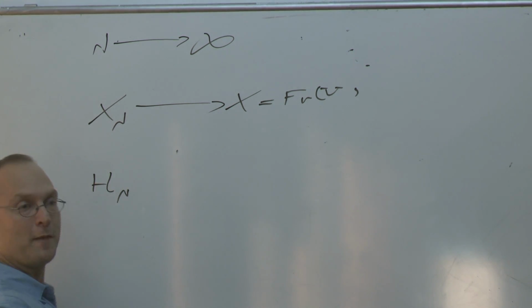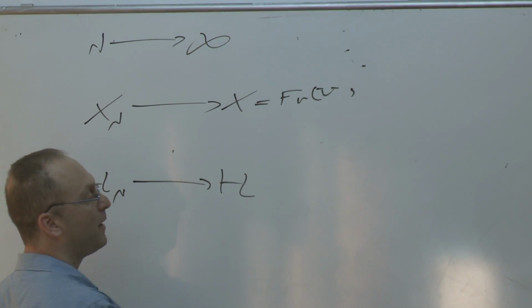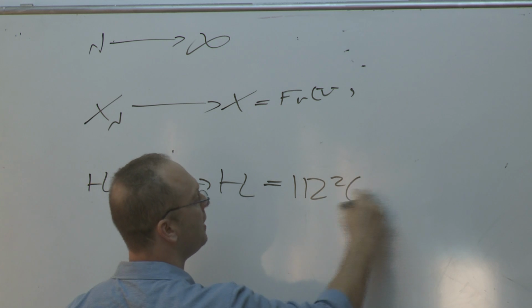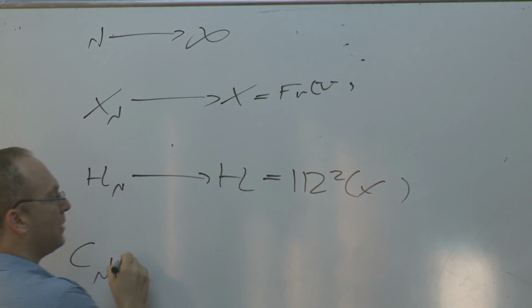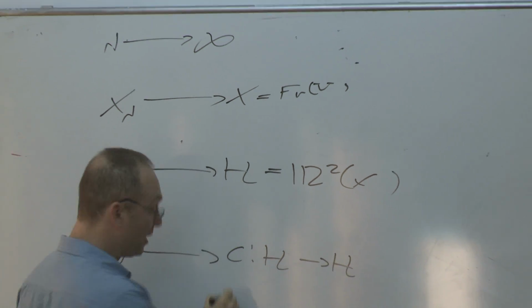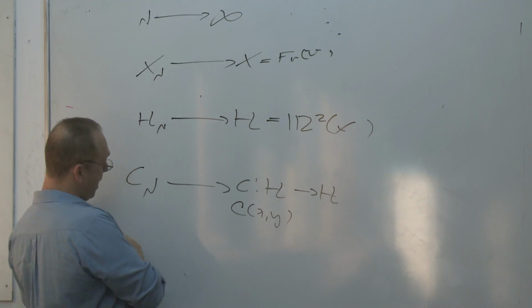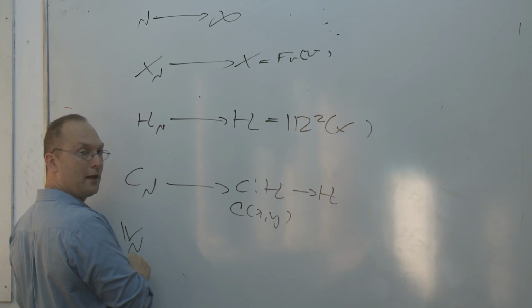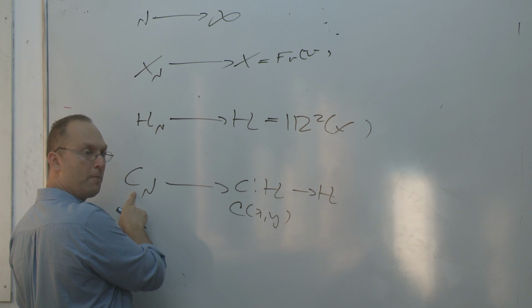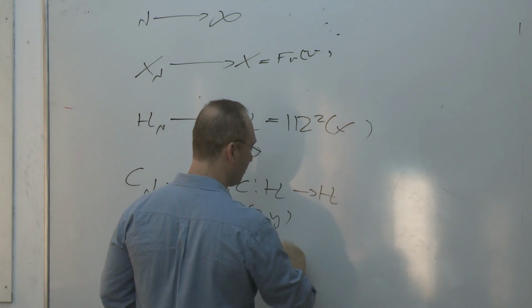The Euclidean vector space H_n, R^2-valued functions on the set of labels, converges to the infinite space H, which is R^2-valued functions on X. The common line operator converges to an integral operator from H to H, whose kernel is just the common line matrices, the same kernel. And this model that we constructed, which is the top eigenspace of this finite operator, converges in the limit to the maximal eigenspace of this operator.